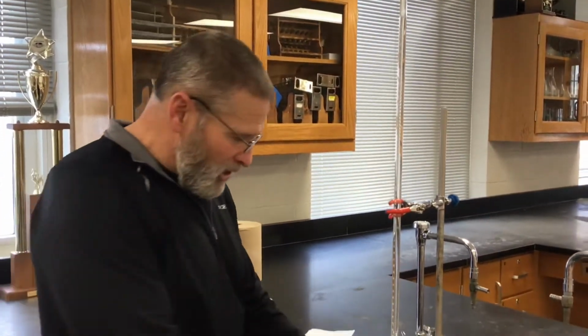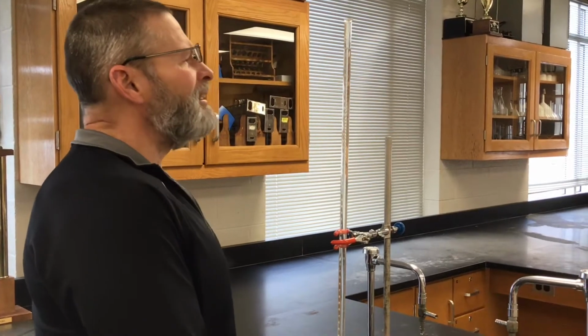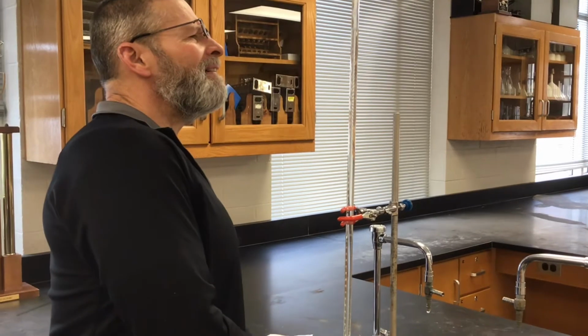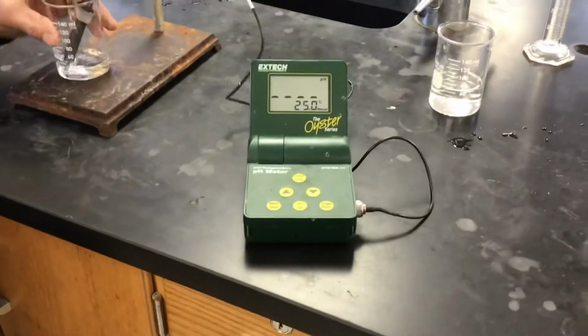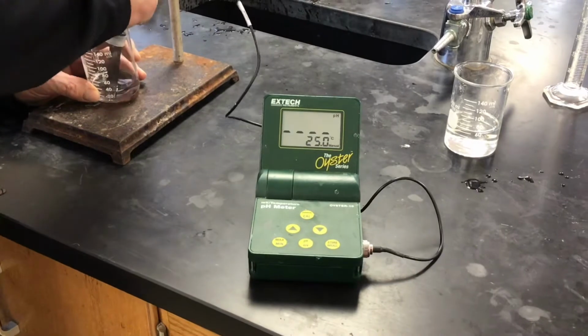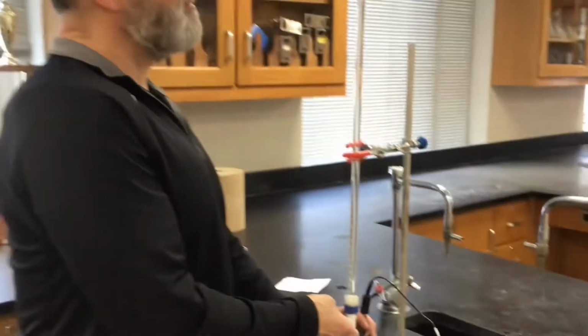All right, so here we go. Now we're going to add the sodium hydroxide to it. And we're going to add a milliliter. For a while, we'll be going 1 milliliter at a time. There's 1. Okay, here's our pH, but we're going to still call that 0.00. And hopefully before too long, it'll read something.